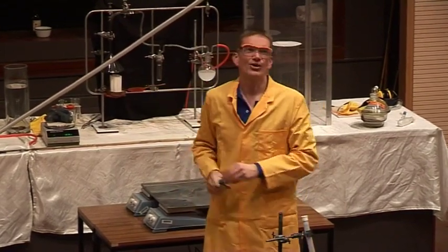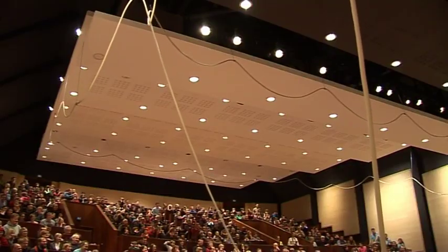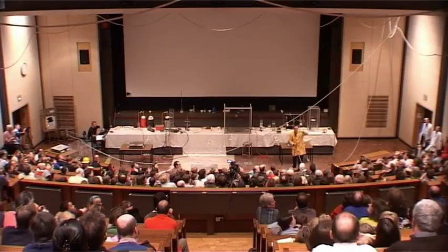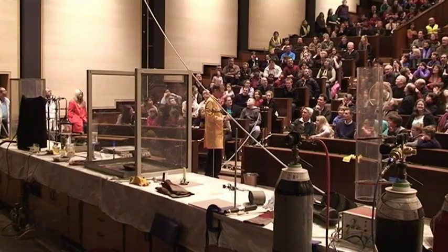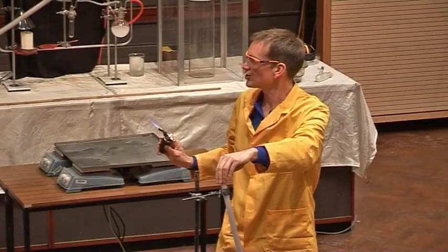Don't look at the target. We'll look at the target later. What you need to look at is the pipe itself. So you need to look above you. That's where all the action is going to be taking place. So look up at the pipe itself. Now, this reaction happens pretty quickly. Blink and you will miss it. So just look up at the pipe, and we'll take the lights down. Okay, thank you. And after 5, I will light this, so you just look up, okay? 5, 4, 3, 2, 1.